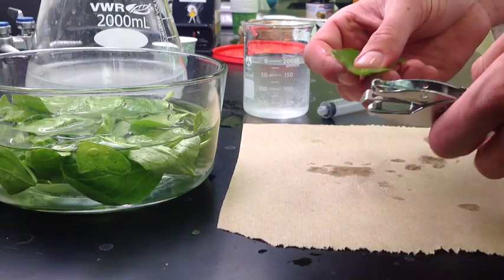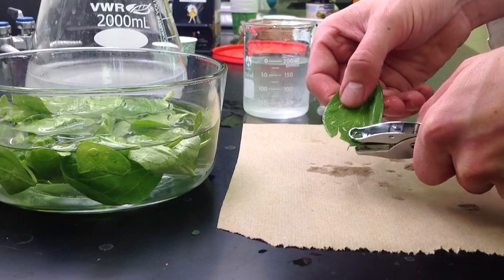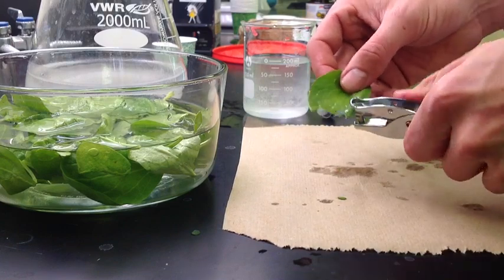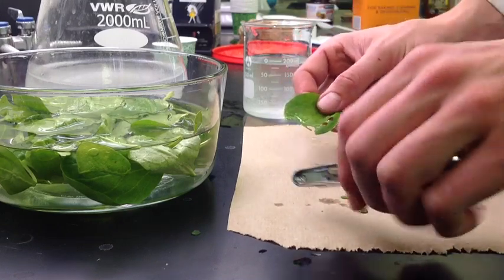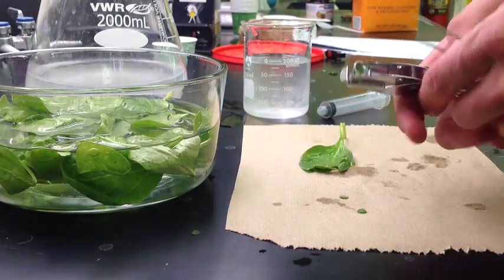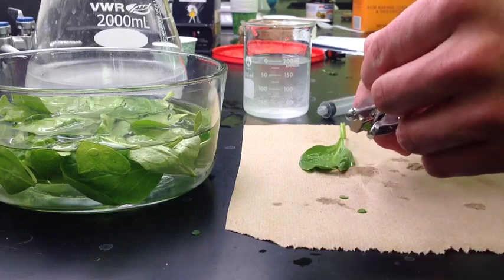To cut out your spinach discs, simply take a paper punch and cut out discs, each time dropping them onto a piece of paper or a counter. You want 10 to 20 of these spinach discs by the time you are done — the more you have, the better. If your spinach discs stick to your paper punch, simply use forceps to push them out.